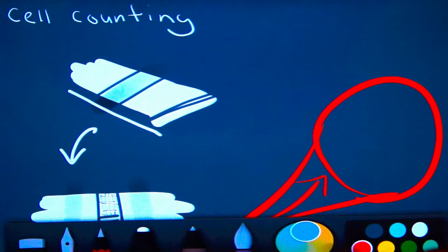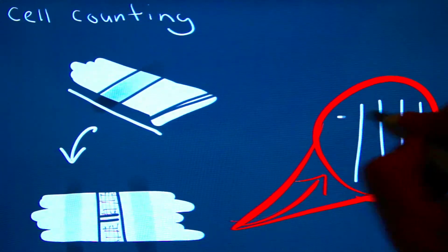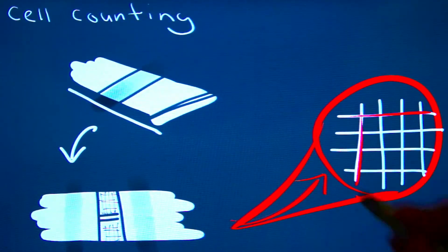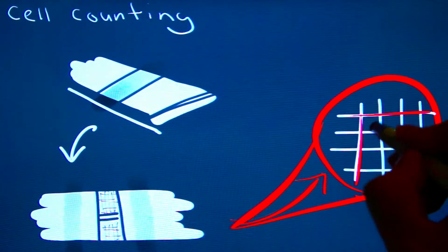Cells in suspension are introduced into this area and are then counted. The number of cells in the chamber can then be used to determine the concentration of the sample.